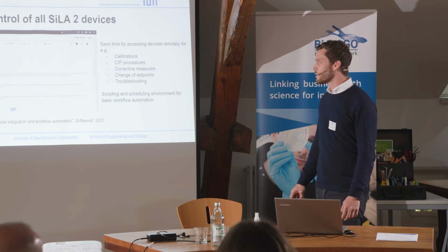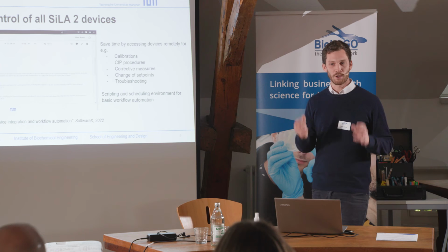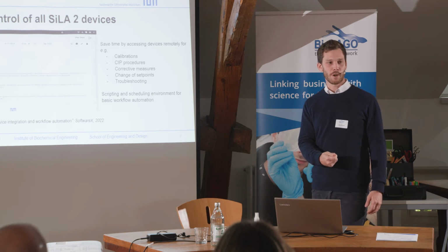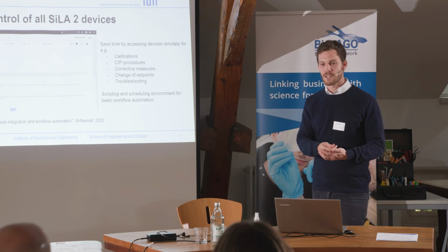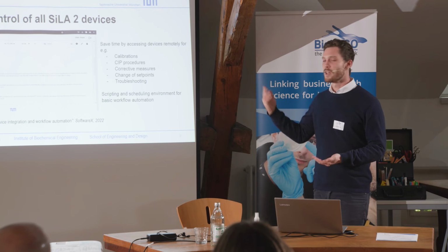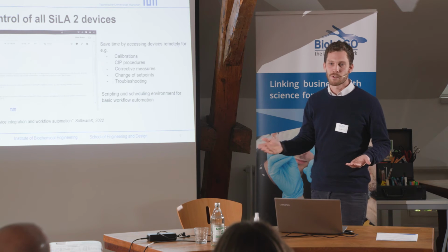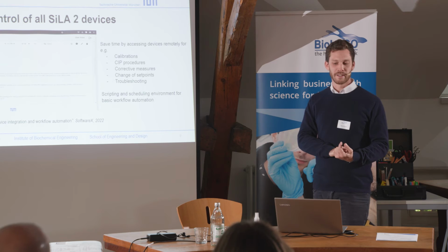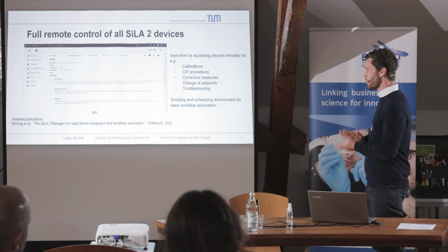So sometimes you have, I don't know, sleepless nights. I even installed a camera at some point in my lab so I could look at my reactors. I had a Slack bot sending me notifications if things were out of bounds. So I got woken up in the middle of the night telling me something is off. Then I could just log in and adjust the set points, restart a stirrer, start pumping my reactor empty and refilling it again. So I could do that manually as well and intervene in case something went wrong. So that was pretty handy.